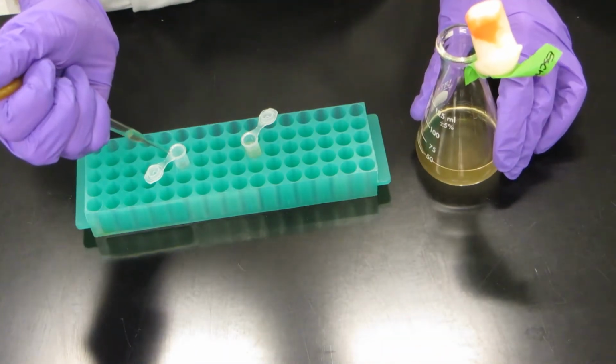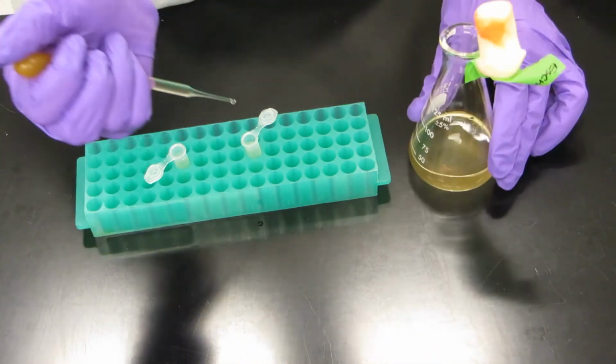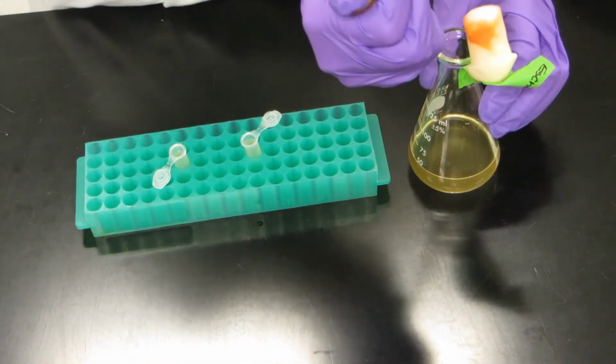You've got to leave a little bit of room in the lid for a tiny bit of air so that the lid goes on properly, but basically I'm going to fill them most of the way to the top, and then they are going to go into the microfuge.